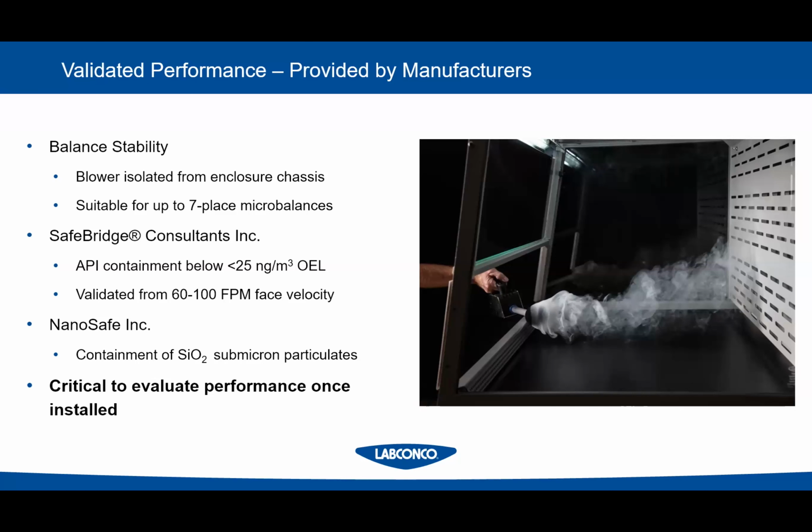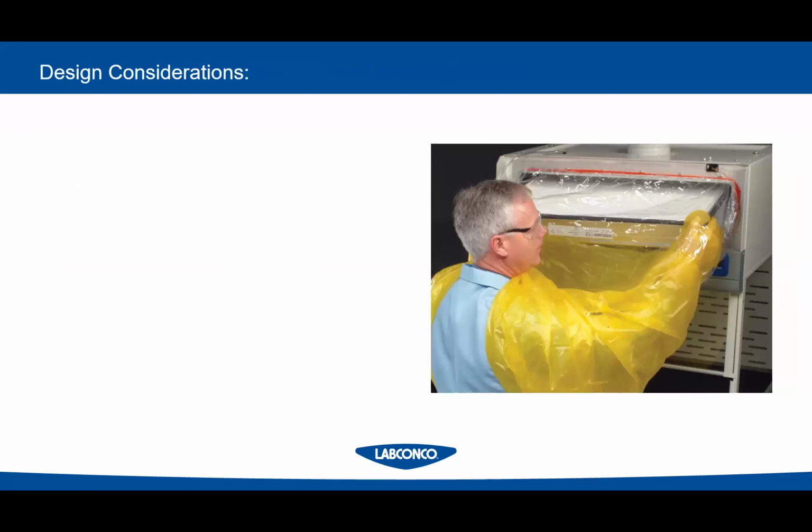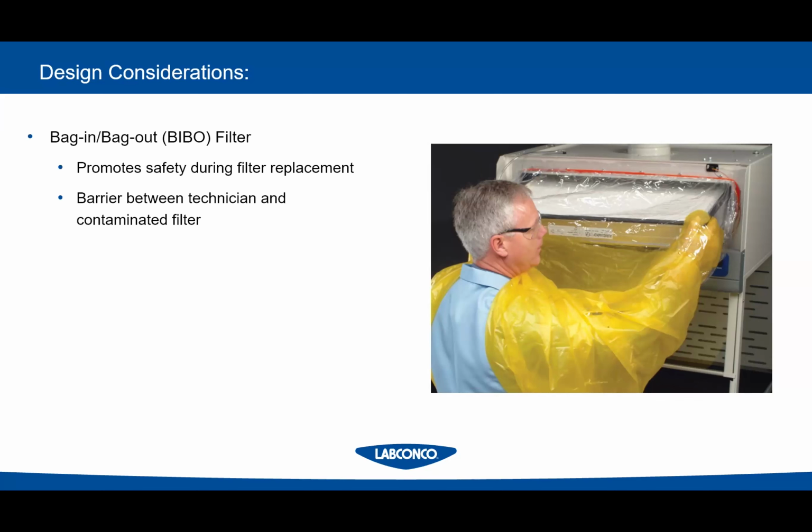And some smoke tests, once you get equipment in there and everything else they're doing, is a great way to look at which way the wind is blowing, right? Is it coming back out? Is it all going in? Great way to test them. A lot of people have also started with 3D printers and things, using particulate counters around the room. So if you think that's something that you need, you can do that as well. All hoods have different ways of testing them, right? There's all kinds of them out there.